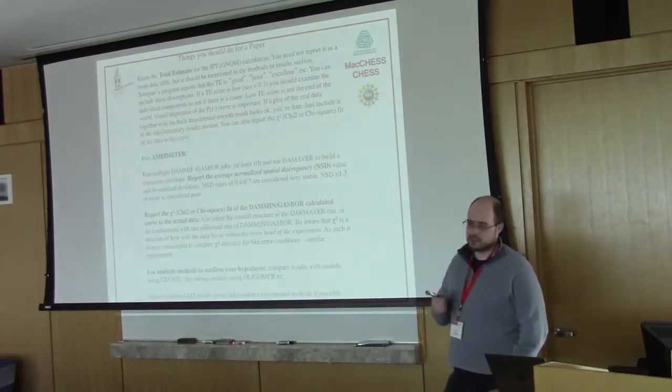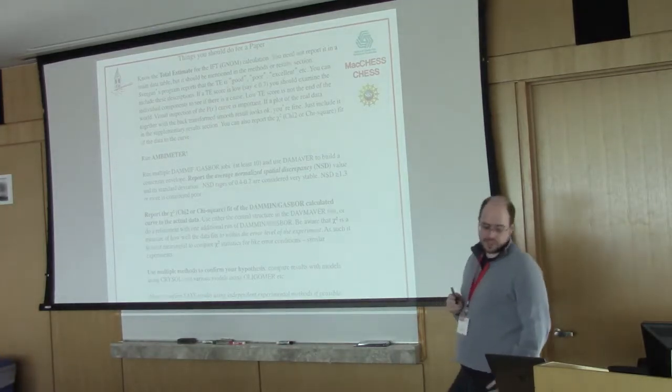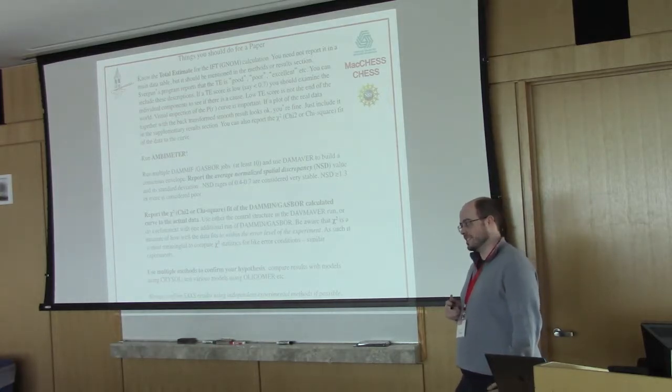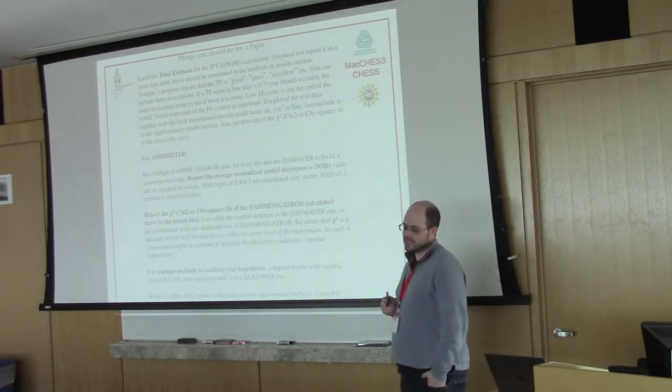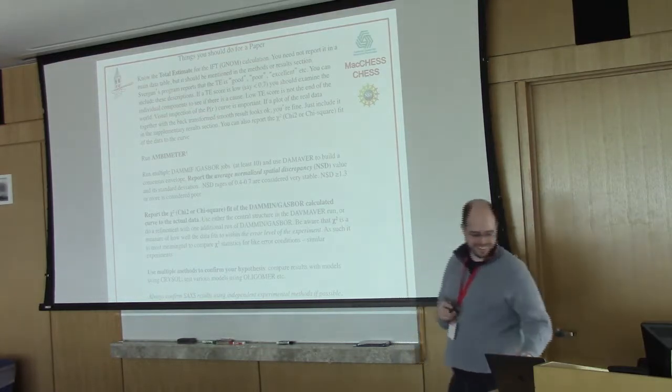And I think Kushal had a quote in his slides that I'll paraphrase, something to the effect of SAXS is much better at determining what something isn't than what something is. So it's a very good way to eliminate possibilities, but it can't always tell you for certain what it actually is once you've gotten rid of those possibilities.